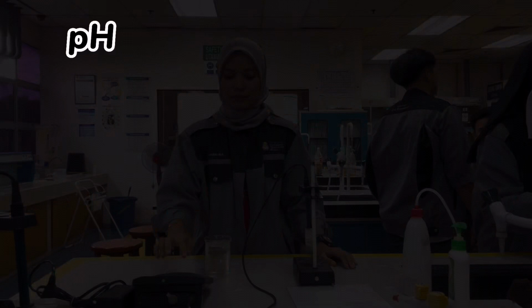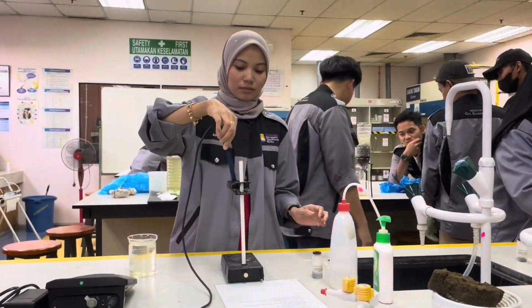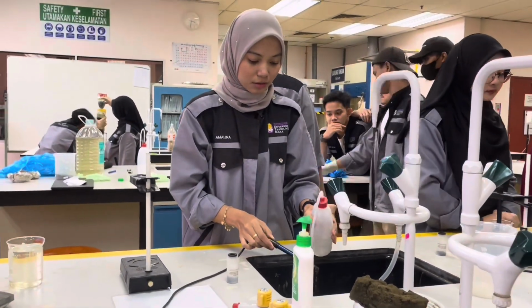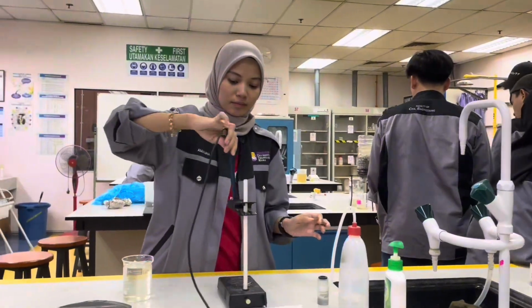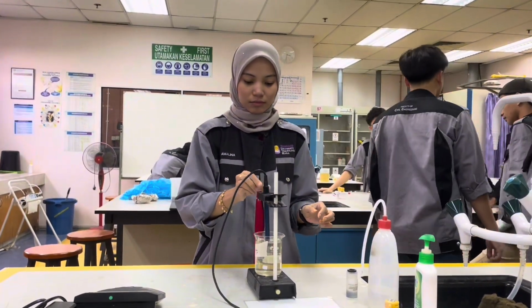pH test before filter. First, switch on the pH meter and then remove the cap of the pH meter. Rinse it with distilled water. After that, put the pH meter into the water sample. Make sure it does not reach the bottom of the beaker. Lastly, press the read button and then record the data.